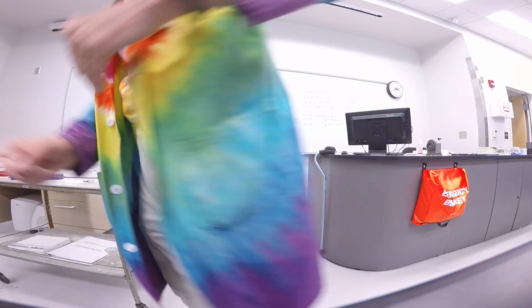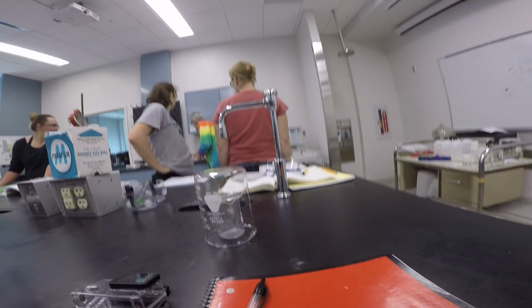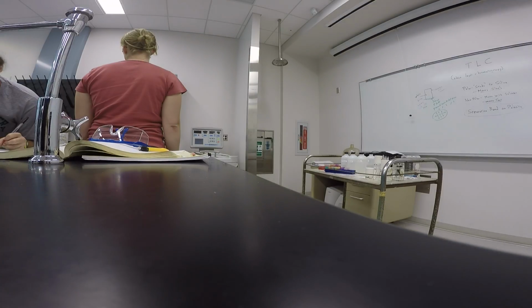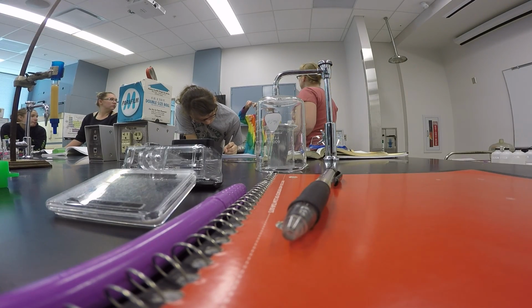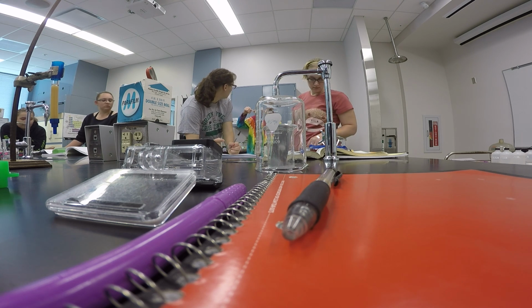and you start collecting fractions. And the way you're going to collect fractions, rather than into a test tube, there's a couple of bags of Eppendorf tubes. Just drip them into the Eppendorf tube, and on the Eppendorf tubes, you can see, what do I say, 1.5 mL fractions? Right there at the top is a 1.5 mL line, so just fill it almost to the top. And I think I say 10 of these. I think it's 15. 15.